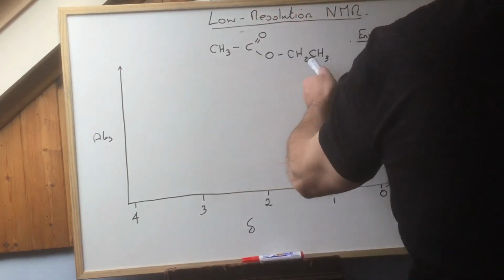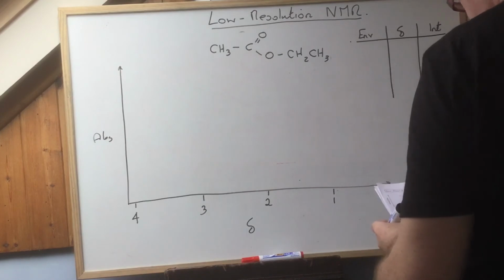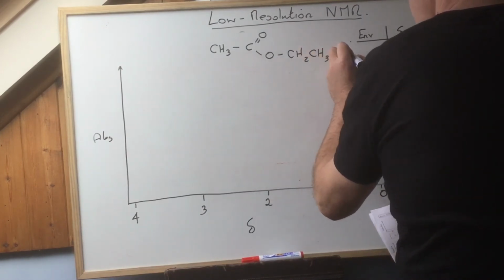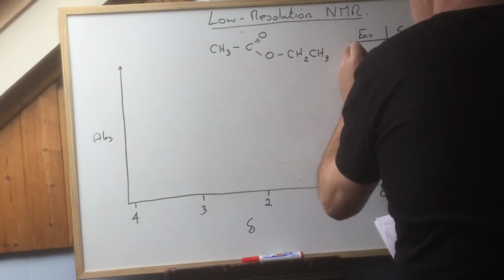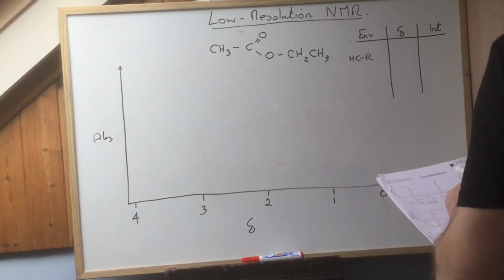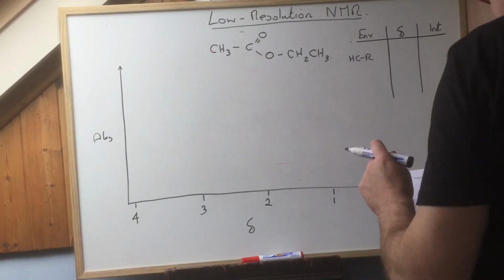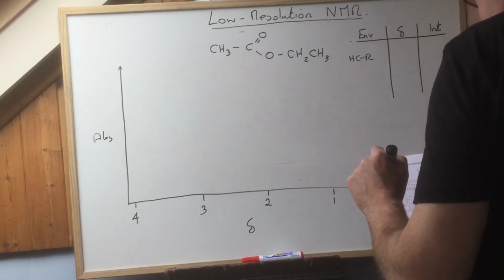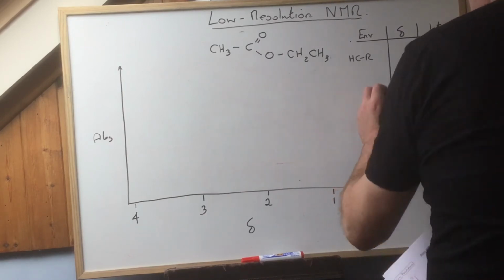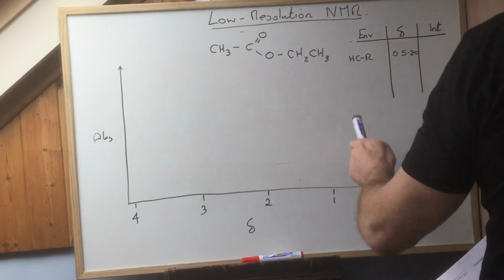Right, let's get onto this environment going over here. HCR, chemical shift 0.5 to 2.0. I'll put the labels on in a minute.